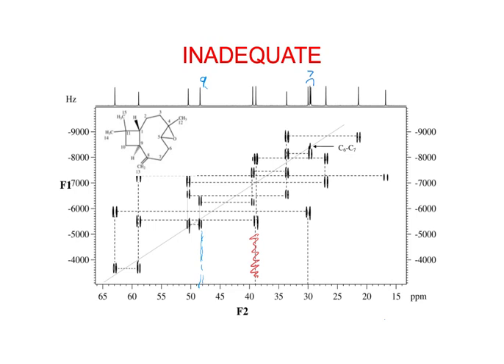Okay, so let's see if we can do this. From 9, notice it has 2 other couplings, well, let's see, yeah, 1 goes back to 8. That's the one that we are off screen now. 1 goes right here, and so this goes to compound number 1. Okay, so that's going from 9 to 1.